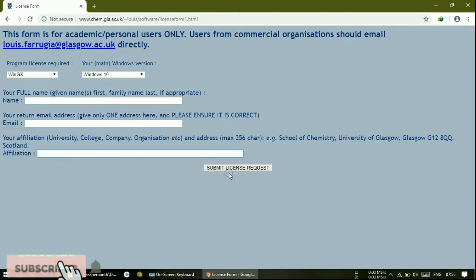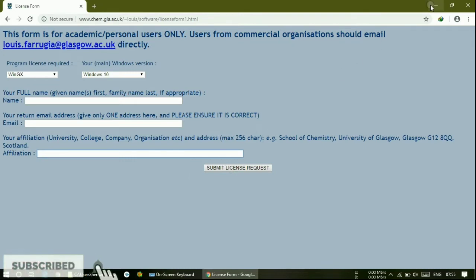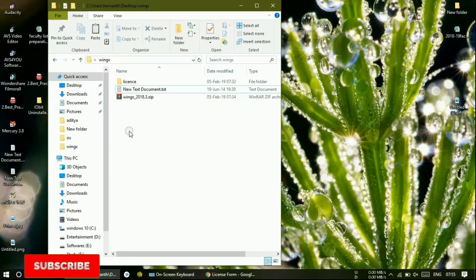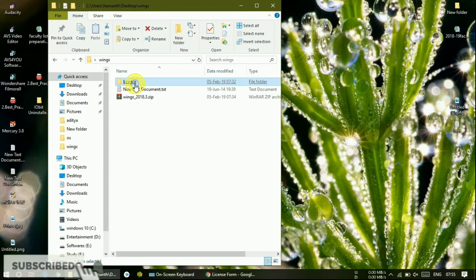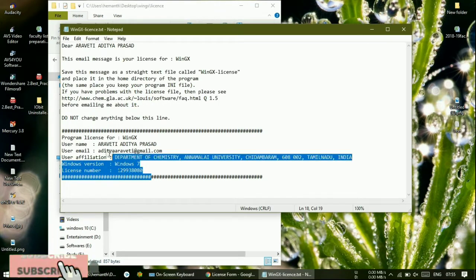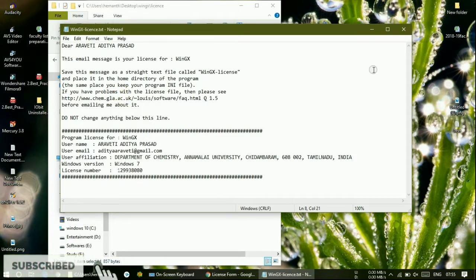They will mail you the license keys to your email ID. The license will look like this — they will send you a mail like this. You will receive a mail with the license file.